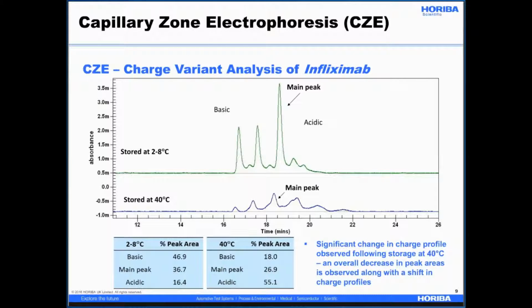This CZE technique provides a high resolution of separation combined with fast separation time. This type of analysis would be highly beneficial to monitor production variations between monoclonal antibody batches. Changes in the charge profile may affect Fc receptor binding, potency, or pharmacokinetic properties. Data from charge variant analysis can be combined with other techniques measuring biological activity to assess the effect of manufacturing variations.